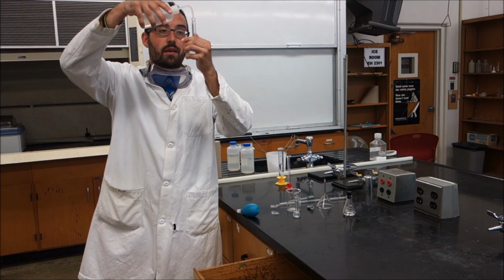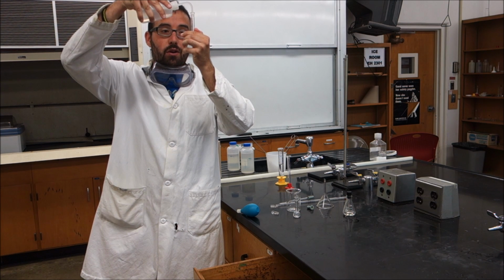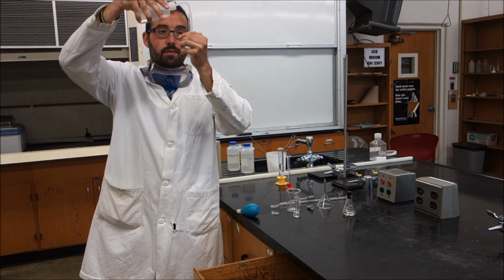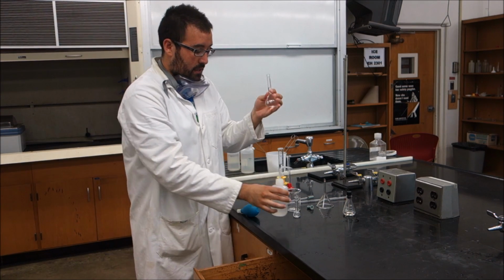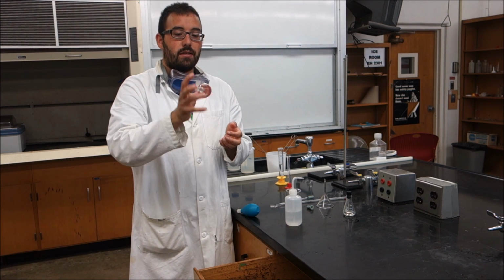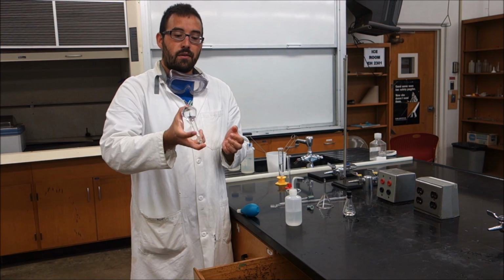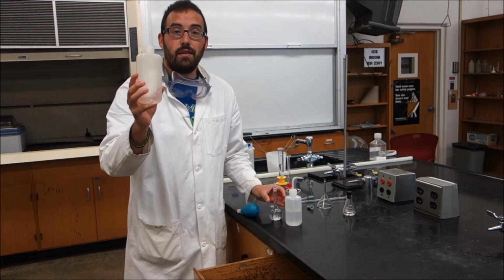So we'll take it, we'll squeeze it. There's going to be a line that we're going to get to. We don't want to go over that line, so we're going to go nice and slow. And then it's right there. We can stopper it, invert it once or twice to get a good mix. And then we'll transfer that to a reagent bottle, which is this bottle right here.